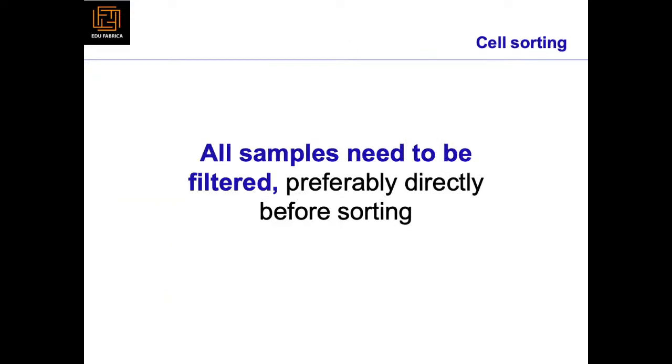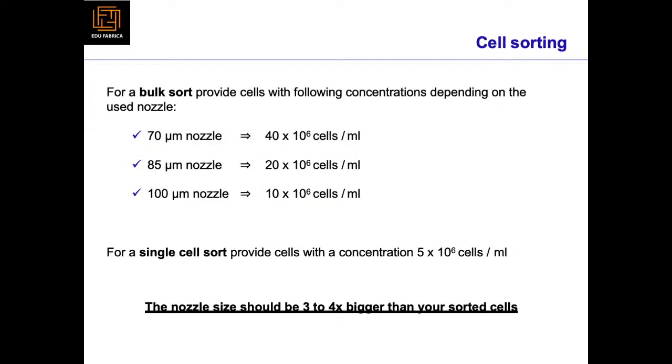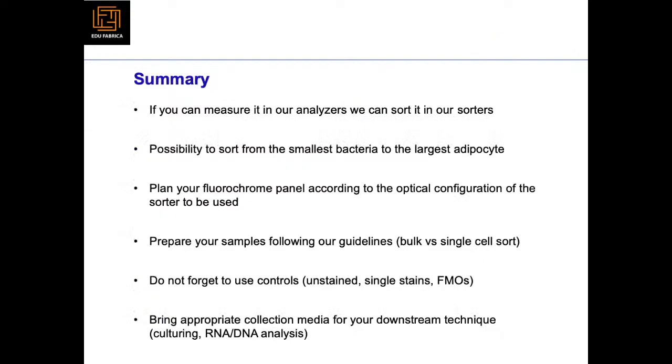All samples have to be filtered directly before sorting. There are some nozzle sizes: 70 micrometer nozzle, 85 micrometer, 100 micrometer. You can use any size of them.